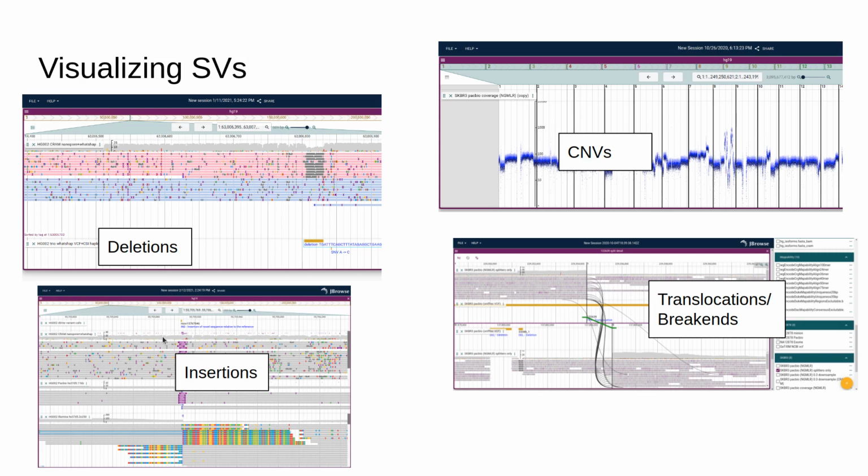We also have some special features for drawing insertions. When there are long reads and a long insertion, these are drawn with a larger purple indicator. If you have short reads that don't fully span the insertion, you can turn on Show Soft Clip Bases, which elucidates the insertion boundaries. We also have the ability to draw whole genomes at a single time on the linear genome view, which helps draw, for example, a whole genome CNV profile from a simple bigwig track.